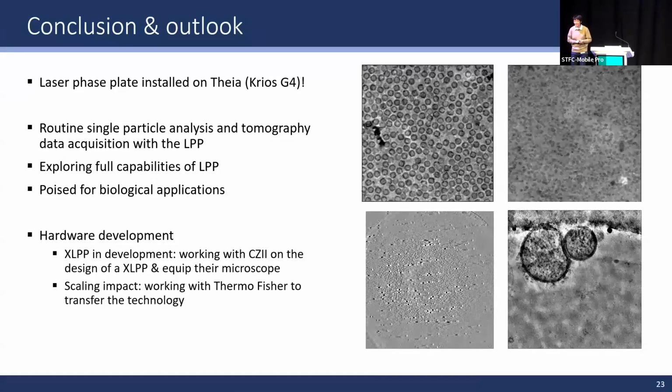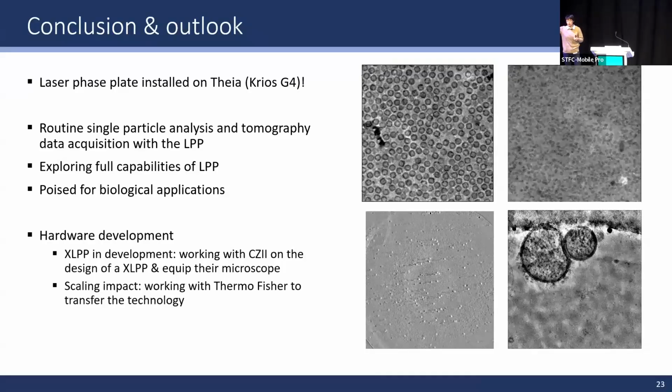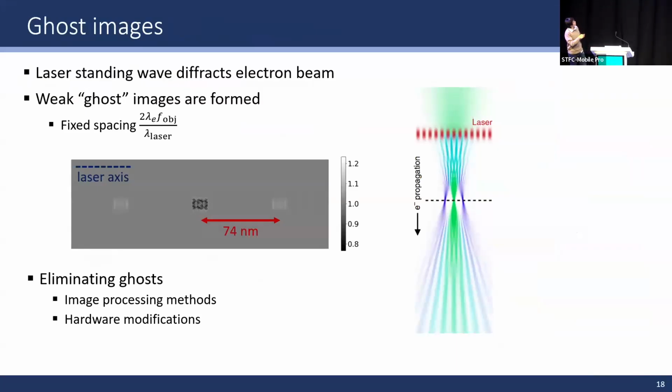Follow up on that: laser grating creates ghosts, and the ghost distance depends on the laser frequency. So can you find a range of frequencies where it's not as drastic, or try to make the ghost really far away? That's a good point, but unfortunately it's limited. We don't have much choice over the laser wavelength, and the objective length is also fixed by the microscope.